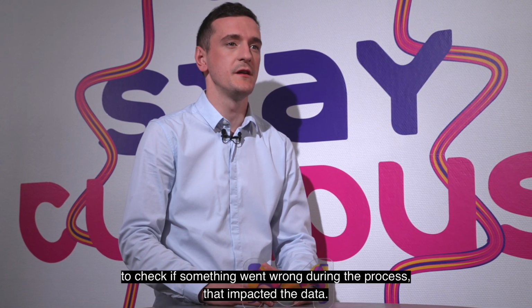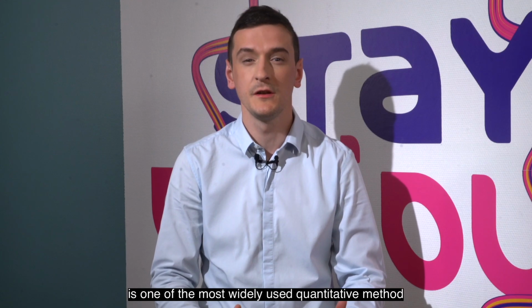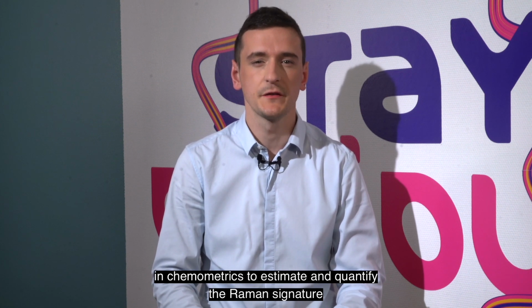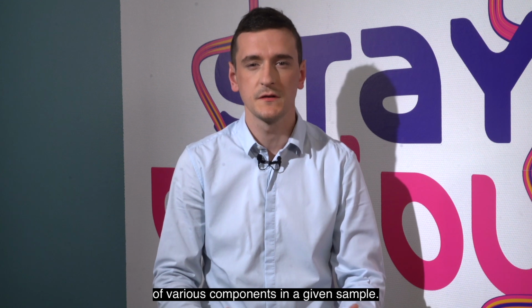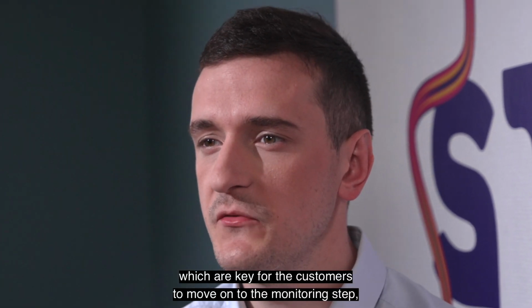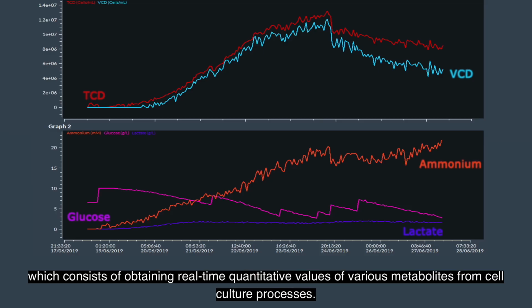that impacted the data. Second, the quantitative analysis, like partial least square regression, which is one of the most widely used quantitative methods in chemometrics to estimate and to quantify the Raman signature of various components in a given sample. This method gives statistical models which are key for the customer to move on to the monitoring step, which consists of obtaining real-time quantitative values of various metabolites from cell culture processes.